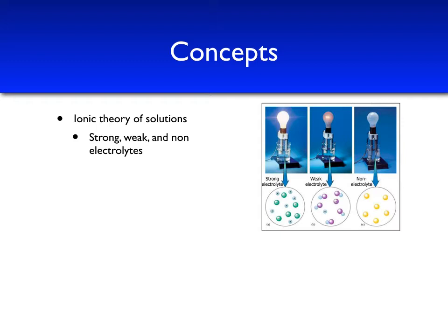This is due to the fact that all of the compound that dissolves in water is converted into ions. Since there are many ions in solution, you get very strong current and therefore a brighter light bulb. On the other hand, for non-electrolytes, there are no ions in solution, which does not allow for the circuit to be completed. Therefore, the light bulb does not light up.